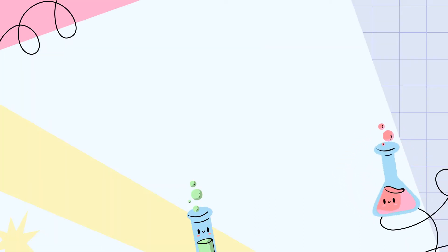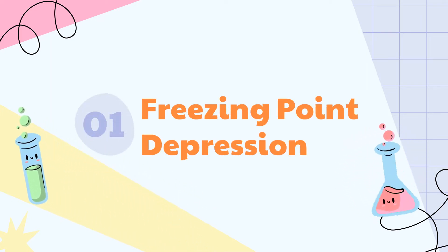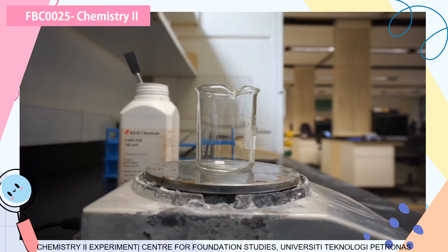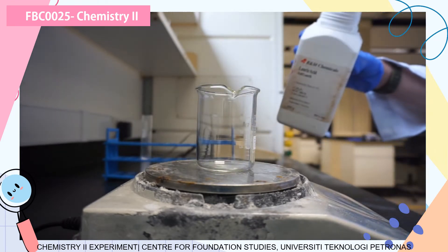There will be two parts in this experiment. In the first part, we are going to explore freezing point depression using lauric acid as a solvent and benzoic acid as the solute. Before we start, I want to mention that we are going to use Vernier LabQuest for data collection. You must set it up correctly according to the instruction given in the lab manual. Do not skip that part, and you have to heat a water bath as well.